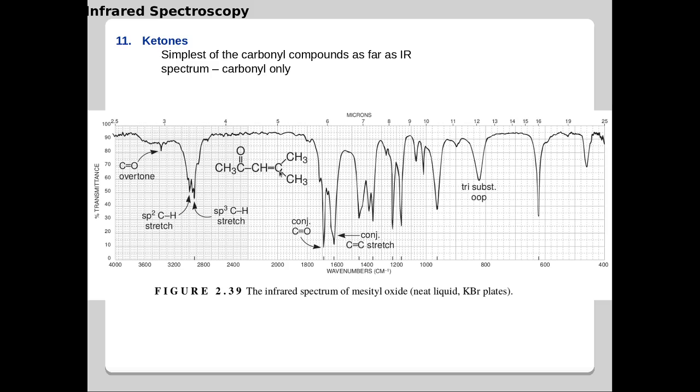And for such a vinylene system, as you may remember, the out of plane bending vibration of the functional group comes around 820 centimeter inverse. That's exactly what you see here. So this one is a discernible signature band of the tri-substituted vinylene type system, as we have seen in this typical molecule.